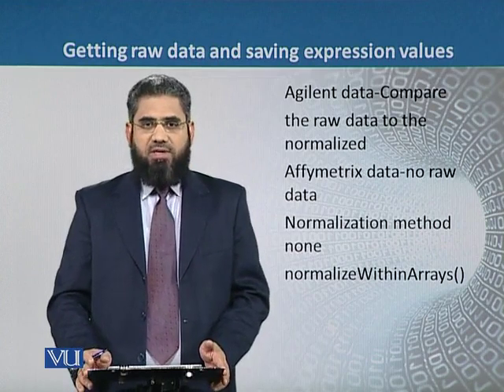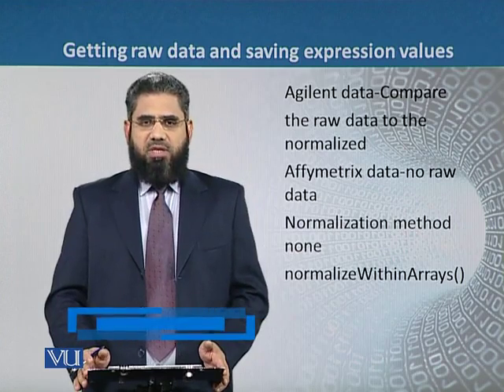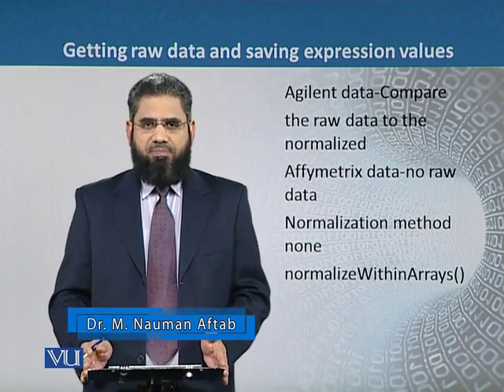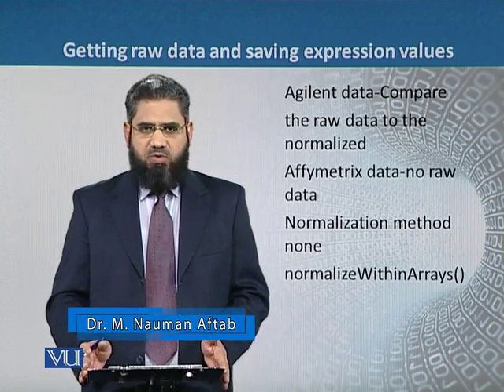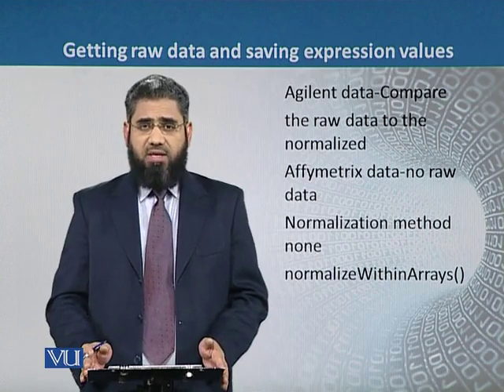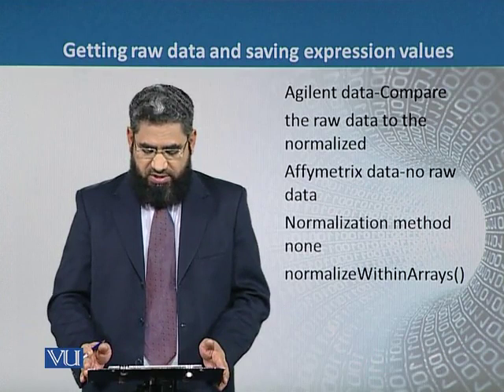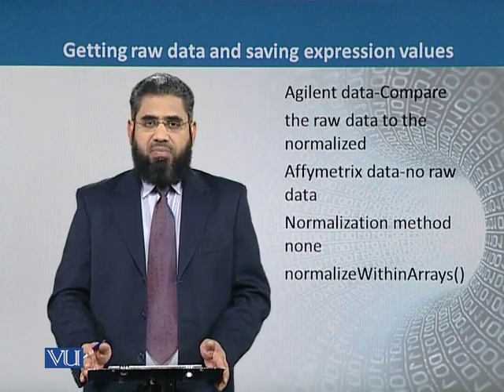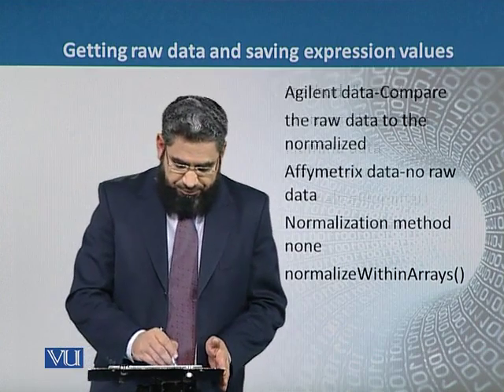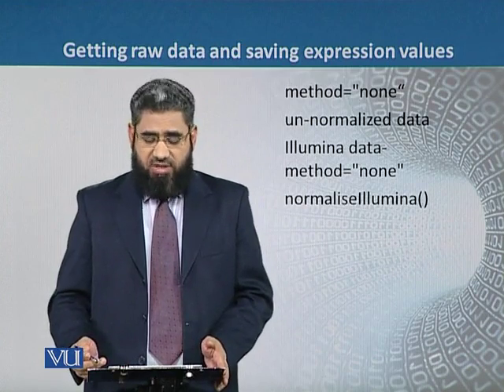But in case of Agilent, we can retrieve the raw data by using the argument, that is, we can use the argument none when we are using the process of normalization. And in the limma package, there is a command that is known as normalizeWithinArrays, and we can use the argument none and we can get the raw data in case of Agilent.